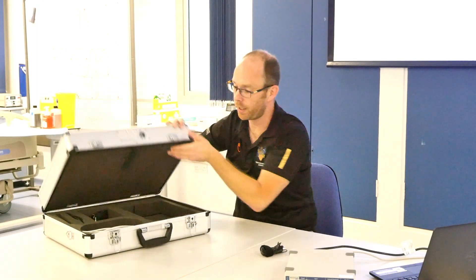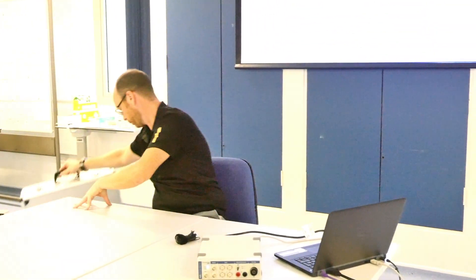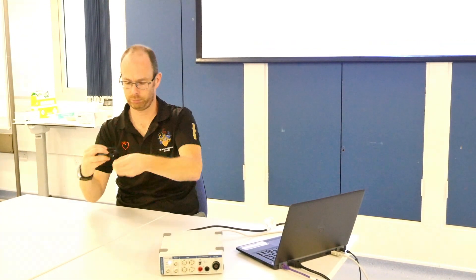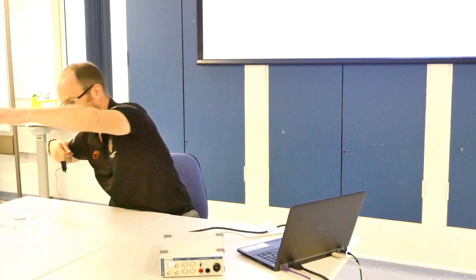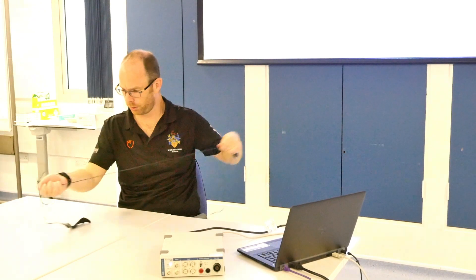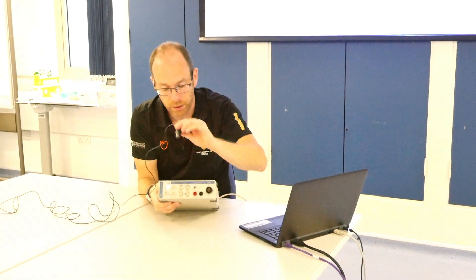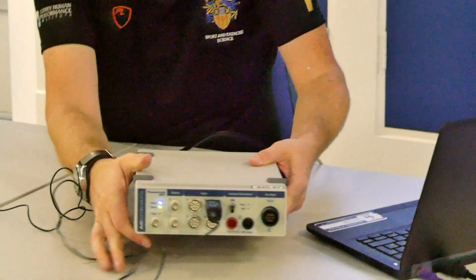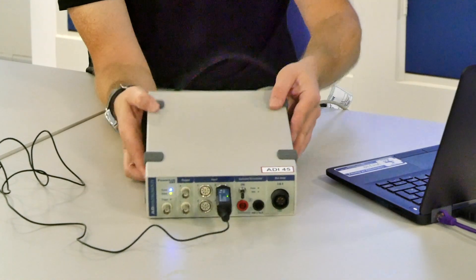As we're not using anything else in the suitcase we're going to put that away for now. With this lead we're going to unwrap it — it has a long cable — and then we'll plug it in. In this case I know it goes into plug number two. Plugging it in at the top, you can see the AD Instruments logo at the top.